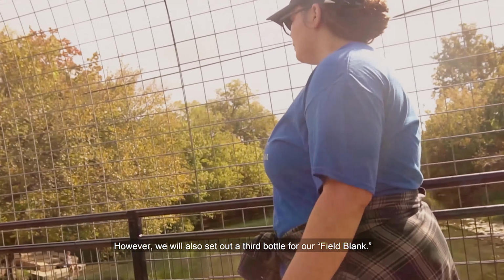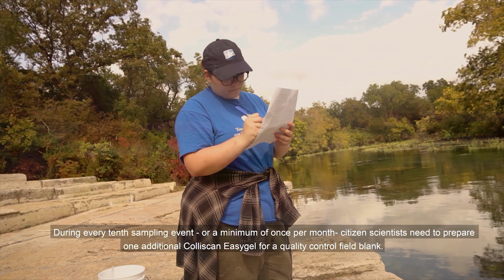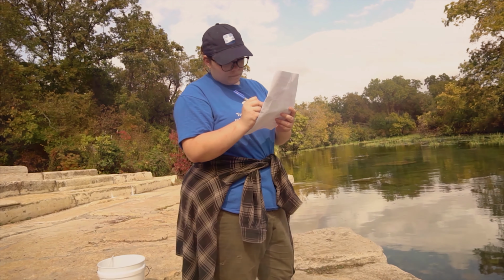During every 10th sampling event, or a minimum of once per month, citizen scientists need to prepare 1 additional Coliscan Easy Gel for a quality control field blank. Field blanks are used to assess potential contamination from sample handling, airborne materials, equipment, media, and other sources.